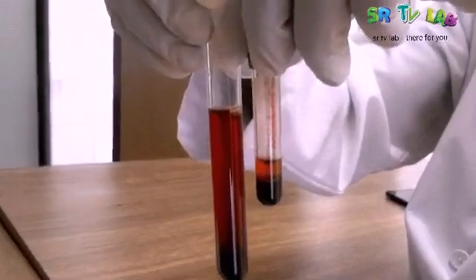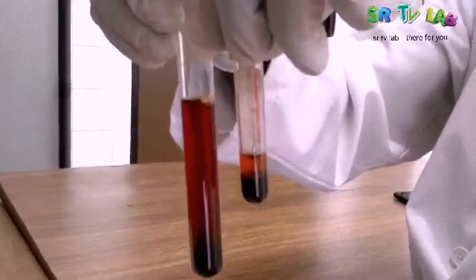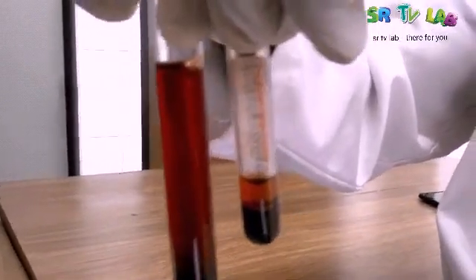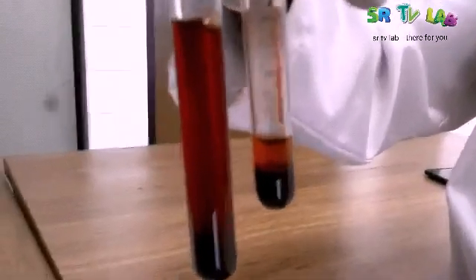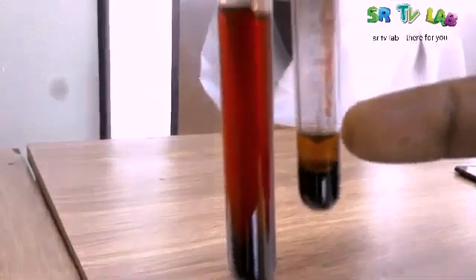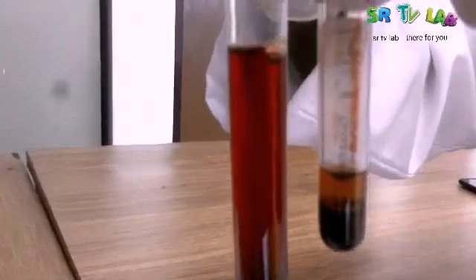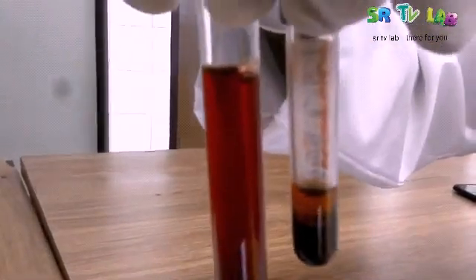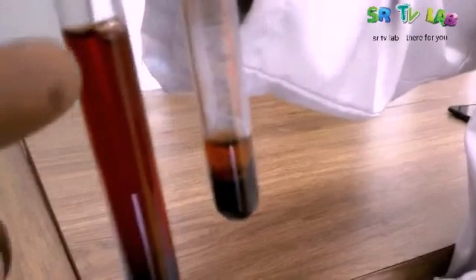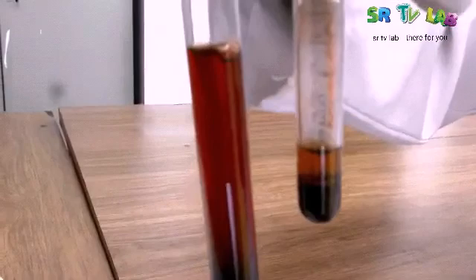You see this small tube has normal blood — the upper part is plasma, the lower part is concentrated red blood cells. And this big tube contains blood that has undergone haemolysis. And this is haemolysis.